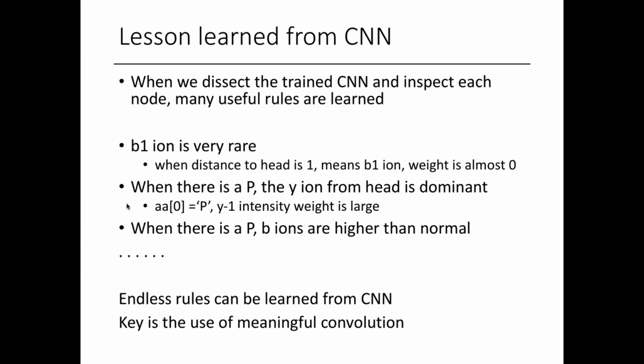For most CID and HCD fragmentation, because of the fragmentation mechanism, the B1 ion is pretty rare, and the B2 is much more dominant in the MS/MS.